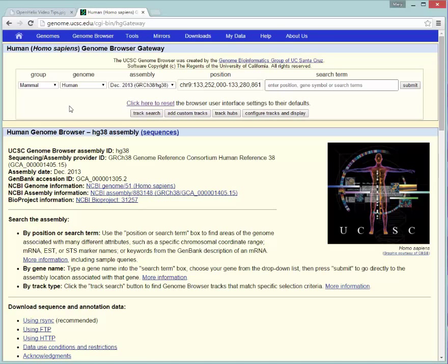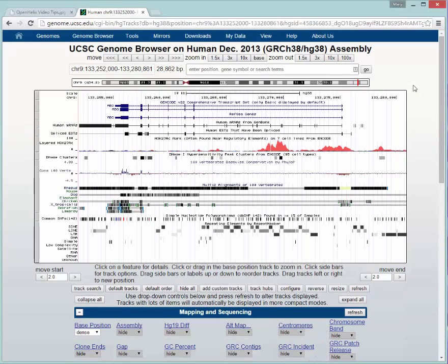But right now, I'm just going to take the default settings that are available here for the Human Current Assembly, this region in the genome. I'll click Submit, and that will give us a graphical browser to try out.